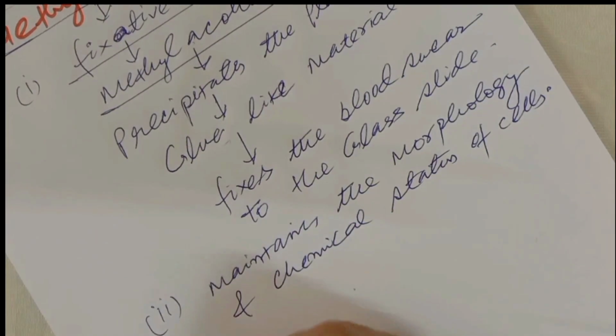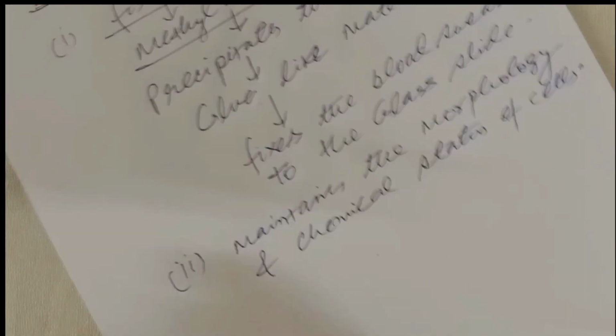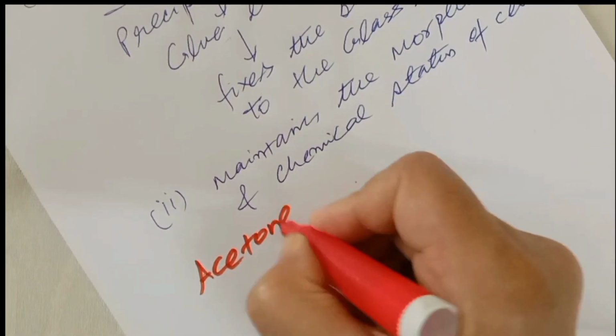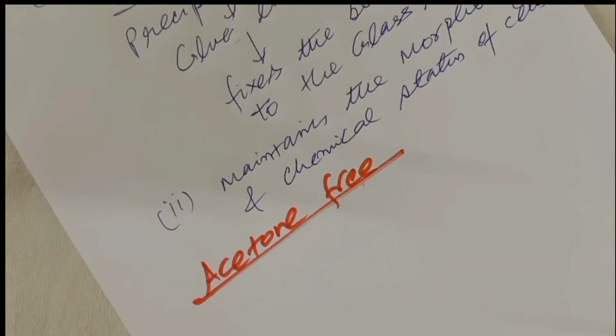But this methyl alcohol should be acetone free as well as water free. First, acetone free. Why should it be acetone free?